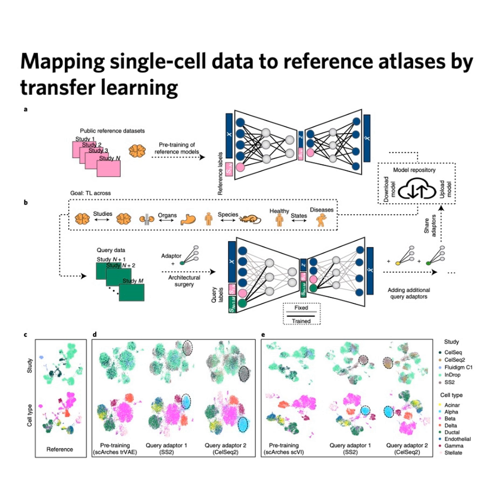First, the matching cell types, like normal tissue-resident macrophages, they integrated perfectly with their healthy counterparts. But, crucially, the model preserved the emergent disease states. What does that mean, emergent states? These were cell populations that simply didn't exist in the healthy reference.